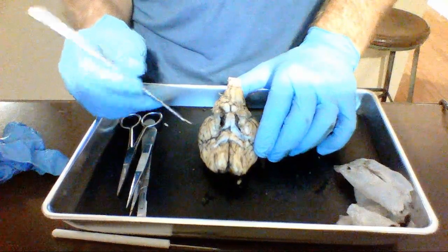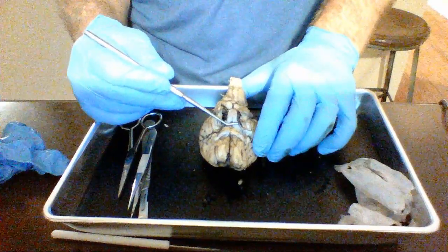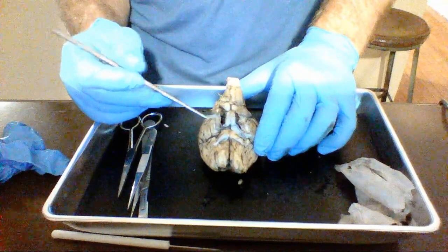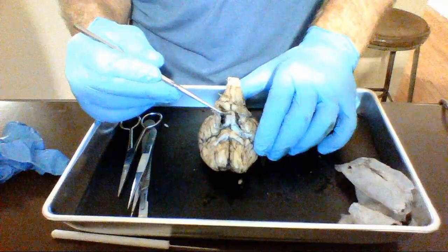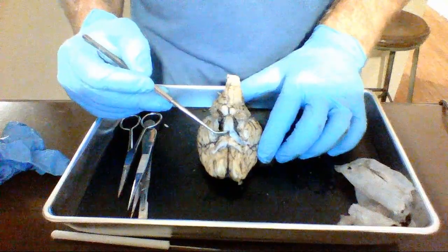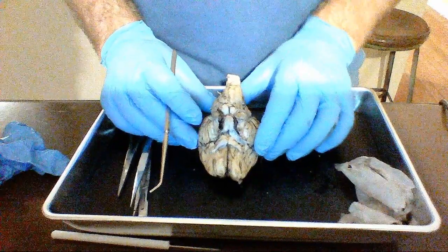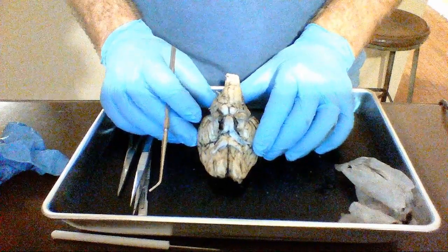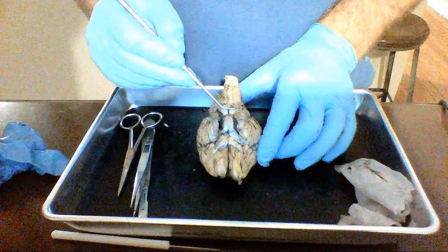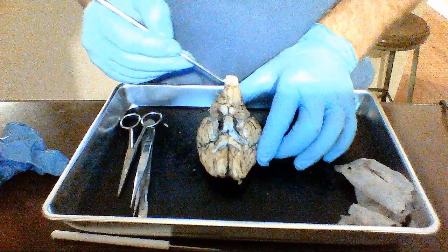Then, right behind that, you've got your pituitary. So that's really important in hormone production. It'll work with the hypothalamus. And then behind that, you've got your mammillary bodies. So you'll notice with the mammillary bodies that they're much larger in the sheep, which is the same for the olfactory bulb compared to human. That's because they're both important for smell, and sheep have better sense of olfaction or smell than we do. Then next you'll see the pons, part of our brainstem, leading down to the medulla oblongata to the spinal cord.